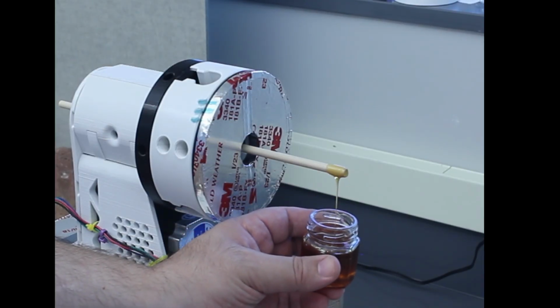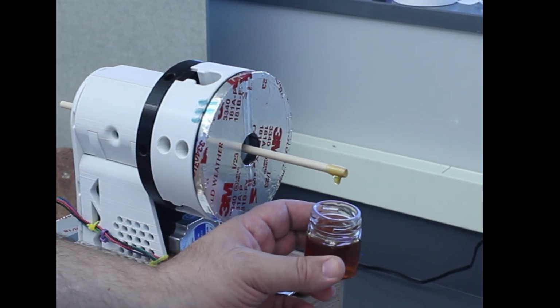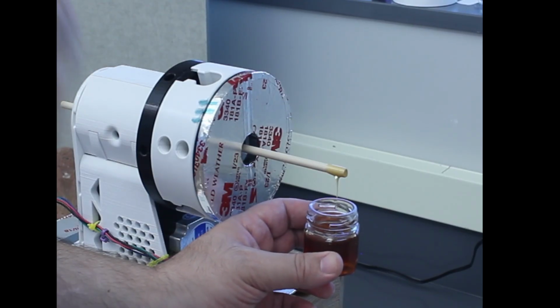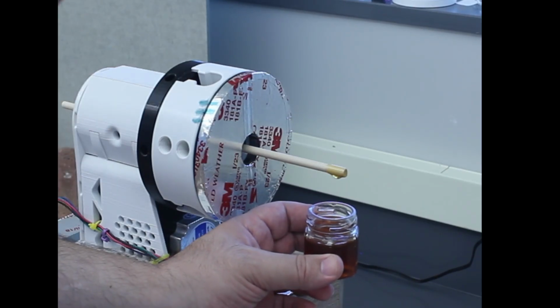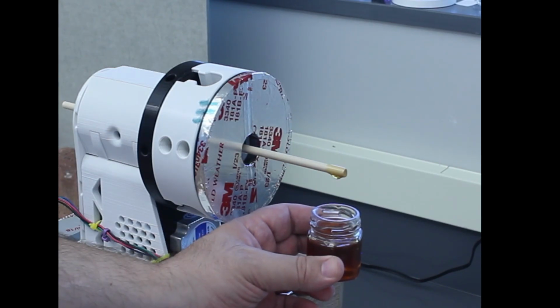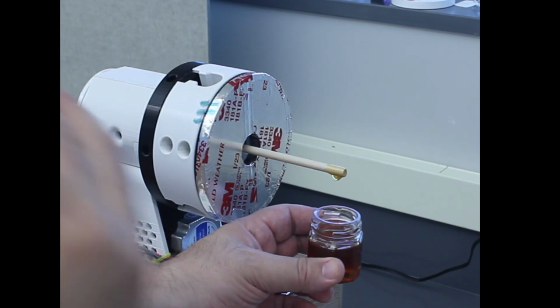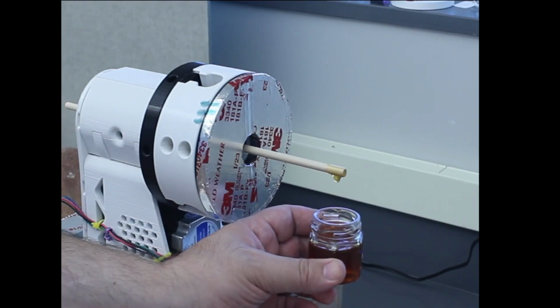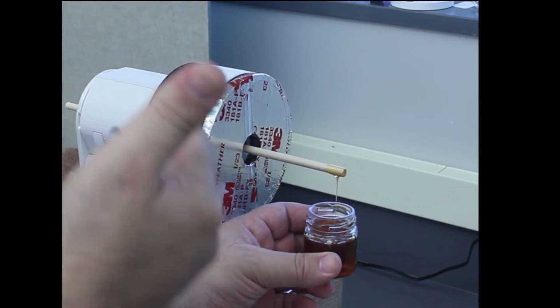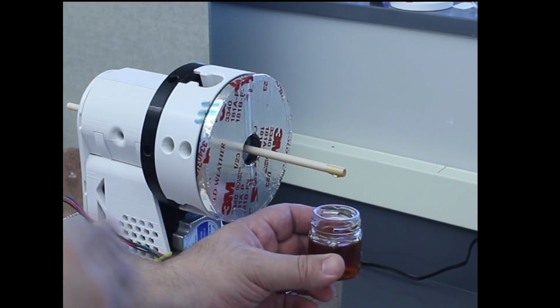But anyway, on the surface this might look trivial, it might seem silly, but it is very important before using the lathe with glass and an open flame to make sure that everything is assembled correctly and that you understand its function as far as setting everything up. Because if you don't have something aligned properly or there's some other defect, the last thing you want is a piece of glass tubing chucked up as you're heating it and then suddenly have it start moving sideways, or have your controller start doing something that you don't understand why it's doing what it's doing. So again, very simple thing.